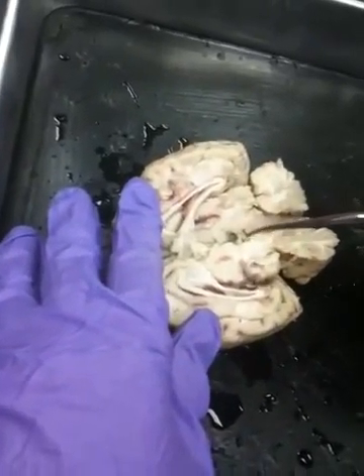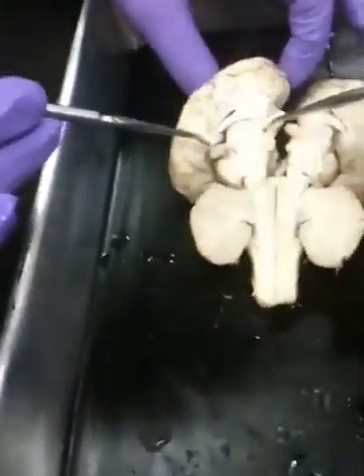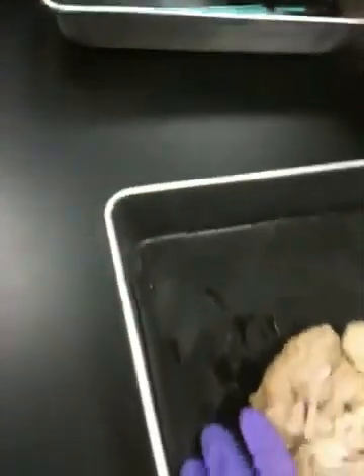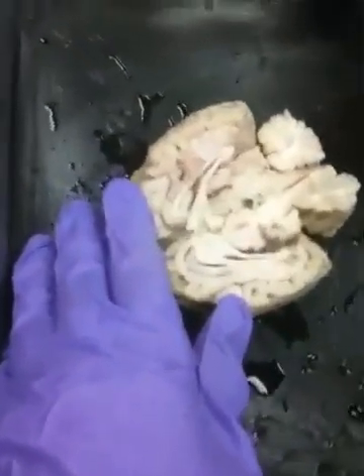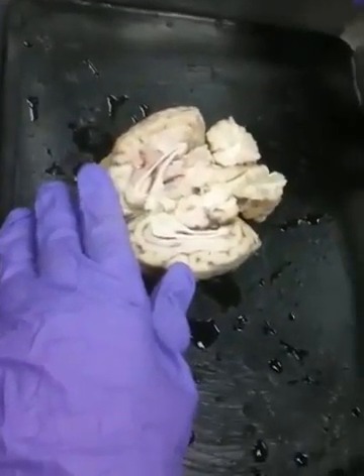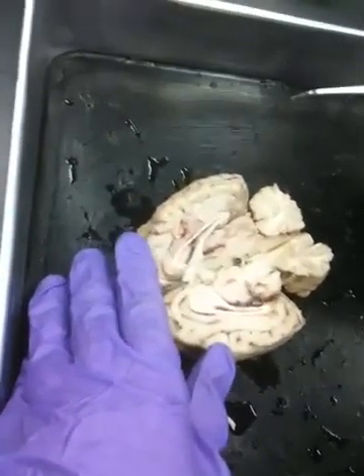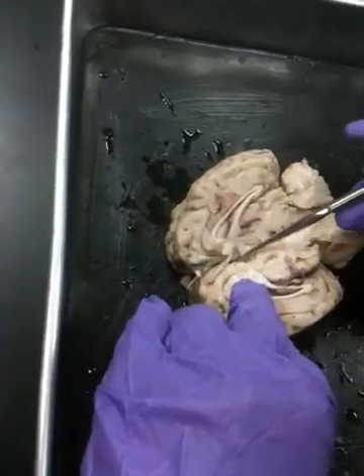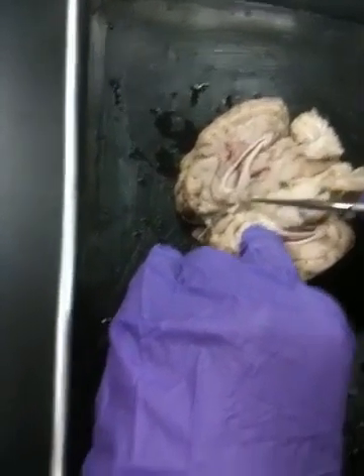Hypothalamus. Hypothalamus kind of sucks on the sheep brain. You're looking for the area of it towards the optic chiasm, so it's down in this area. I never put that on the practical in the sheep brain because it's not clear enough. So that's going to be on the actual model if I put hypothalamus on there. Pineal body. Wait. Pineal body I do like to put on there if we got one. If we didn't get one, we'll cross it off. Yeah, you guys do. This is pineal body. Huge in the sheep.